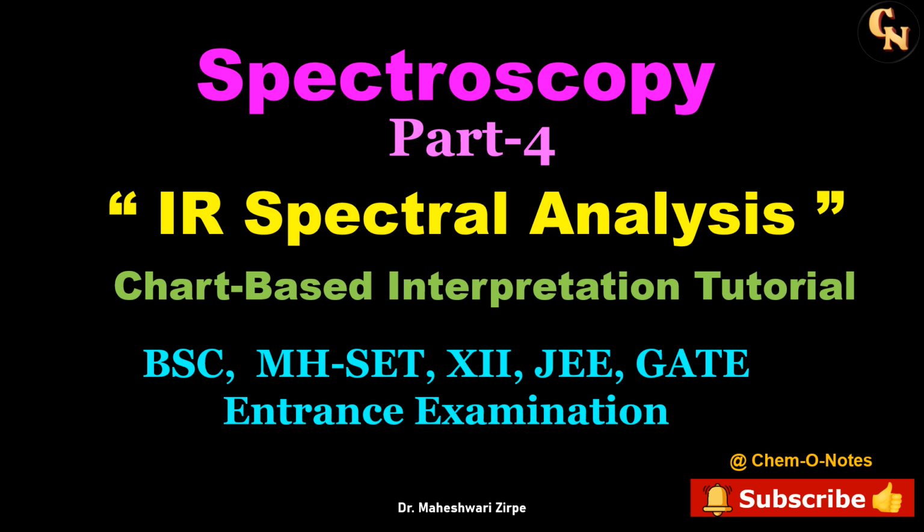So in this video, you will learn how to read the IR spectra and how to guess, when the IR data is given, that a signal indicates which peak. So let's begin.